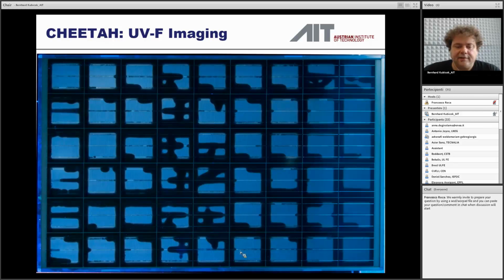And even if you're interested in polymers, I think it's a fantastic tool. Even if, how I use it, it's not quantitative, but only qualitative, I think it's still very interesting to see and quickly find spots that you want to investigate in further detail.